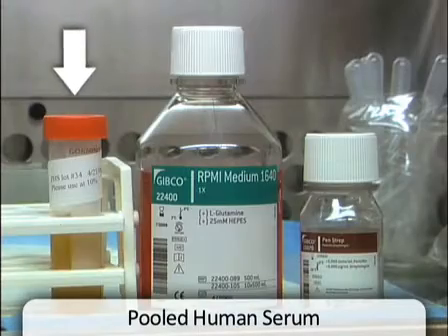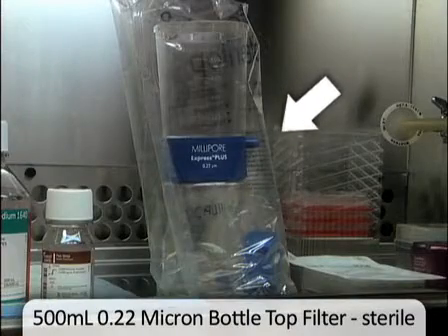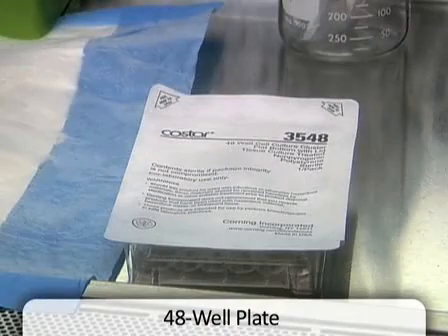Pooled human serum, used to supplement T cell medium. Pen-Strep, used to supplement T cell medium. 500 milliliter 0.22 micron bottle top filter, sterile. 48 well plate, used for in vitro expansion culture step.